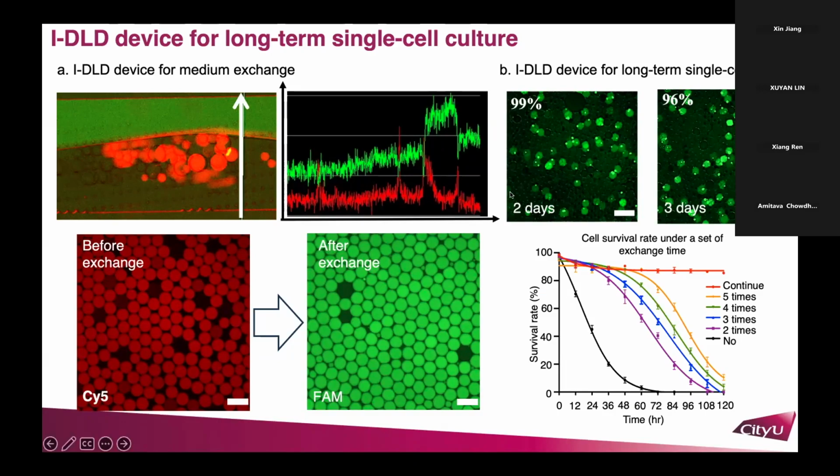Then we applied our device for long-term single-cell culture, and we could achieve a maximum of 5 days of culture, and the cells could sustain viability up to 91%.